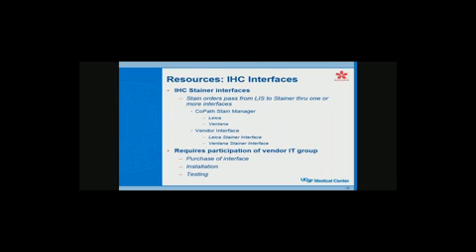So at least in our case, we have a couple of parts to that. The first is we have an order, it goes into what we call a stain manager, and you have to have one stain manager for each type of instrument. So we have a stain manager for each of those, and each of those stain managers cost some money. And then the vendor interface is on the other side that picks up that information that's coming from Copath. So there's one of each of those, and those cost money as well.